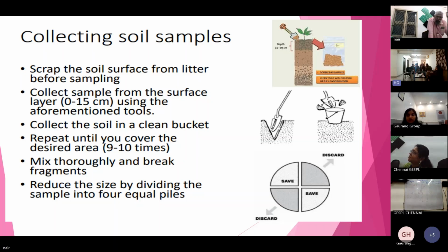How much minimum quantity is required for the sampling of groundwater and surface water or soil sampling? Usually it is 2 liters. If only chemical parameters are required, it is only 2 liters. For groundwater, if toxicity is required, a sample of 10 to 15 liters will be required.